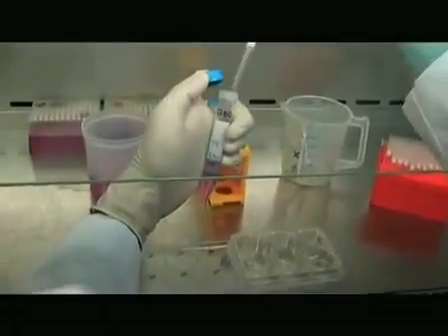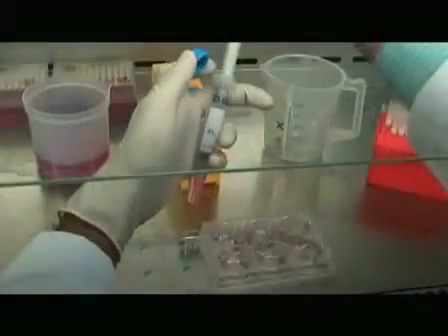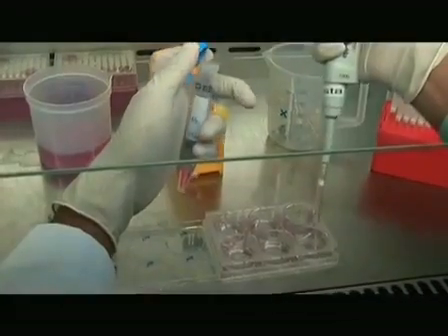To see the immediate effect of radiation on cellular events, keep cells on ice for 5 to 10 minutes prior to and during irradiation. Expose cells to either gamma radiation or X-rays. After irradiation, dispense 3 ml of the cell suspension into each well of a 6-well plate.